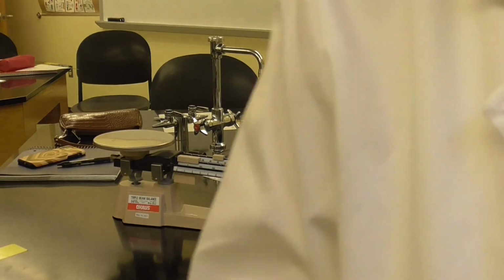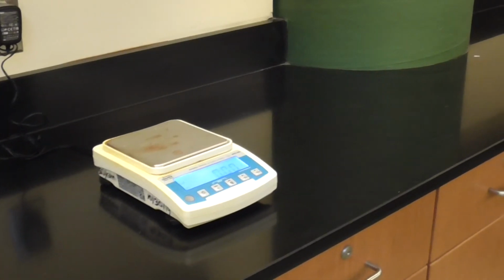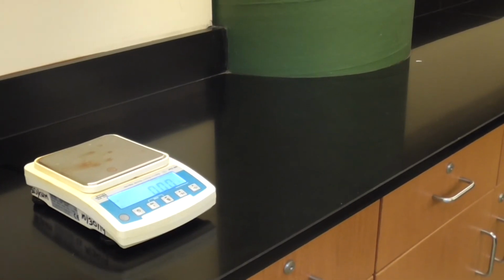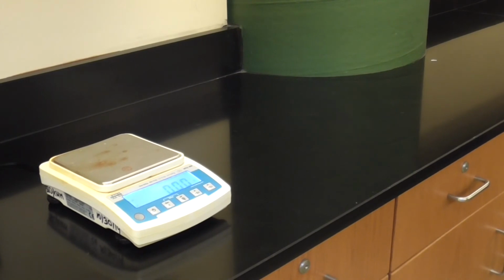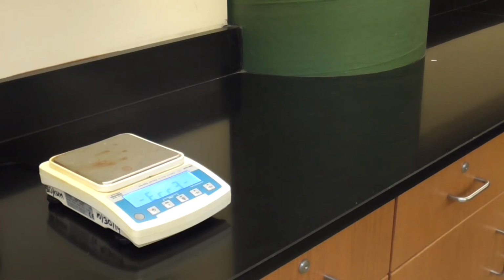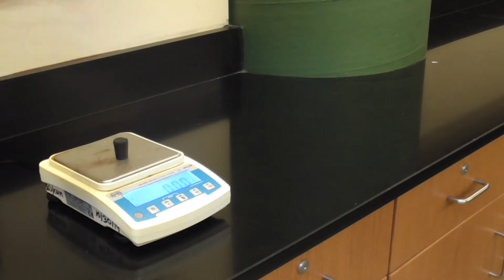The other one that we need to use is this one. The electric one is going to have 2 decimal places, all right? So again, we're going to do the same thing. If we want to measure this guy, for instance, make sure that you dry it and make sure that you tare it. You see the tare here, T? It has to be tared before we use it. And 0. And then I'm going to put that here. So it is 9.06, okay?